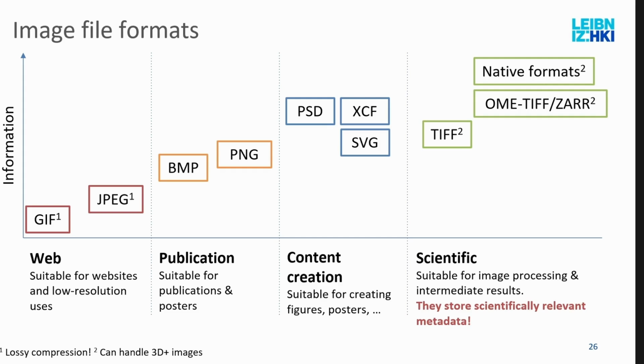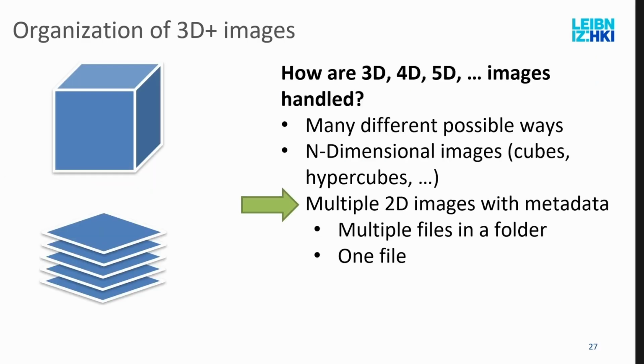So this generally comes in the end when you're making your journal publication or your poster or whatever. But this one you can actually use for real scientific stuff. And you will see now in the next one why. Because you're mostly working with multi-channel or multi-dimensional images all the time, which is now the standard. And it's actually not so trivial to store them in a way that the computer can work with properly.